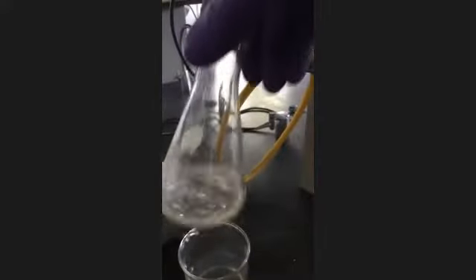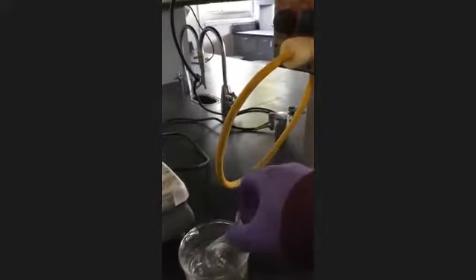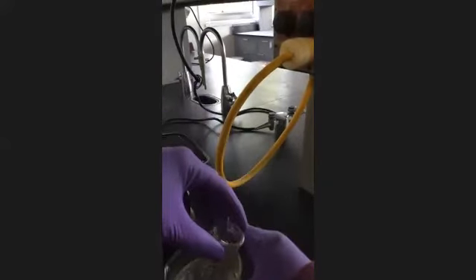You can actually see now it's starting to go into solution. You just need to keep heating it up so it'll go all the way. But I need to get some of this water out of here.